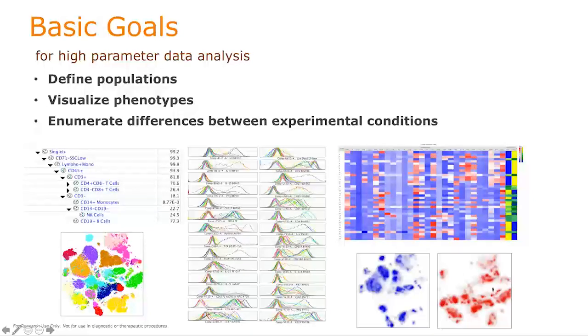And you can see that the stimulated cells have different locations within this T-SNE continent structure that I've produced, indicating that upon stimulation, these cells change, they go somewhere else because the phenotype changes, effector functions are upregulated, and they move visually within this dimensionally reduced data space to a different location. And that's what we're trying to evaluate. How do these populations change? Do they go up? Do they stay the same? Or do they go down across your experiment?